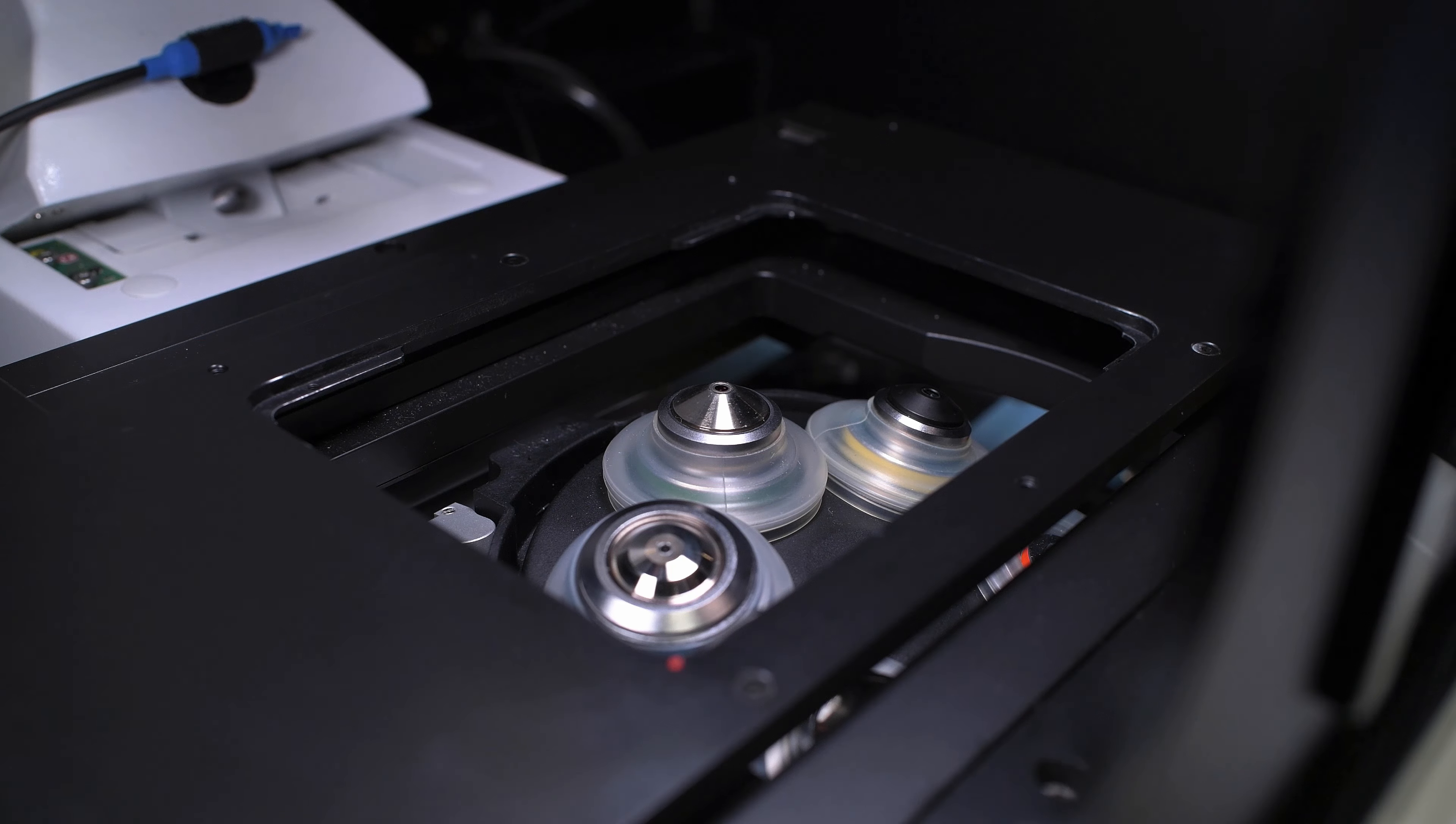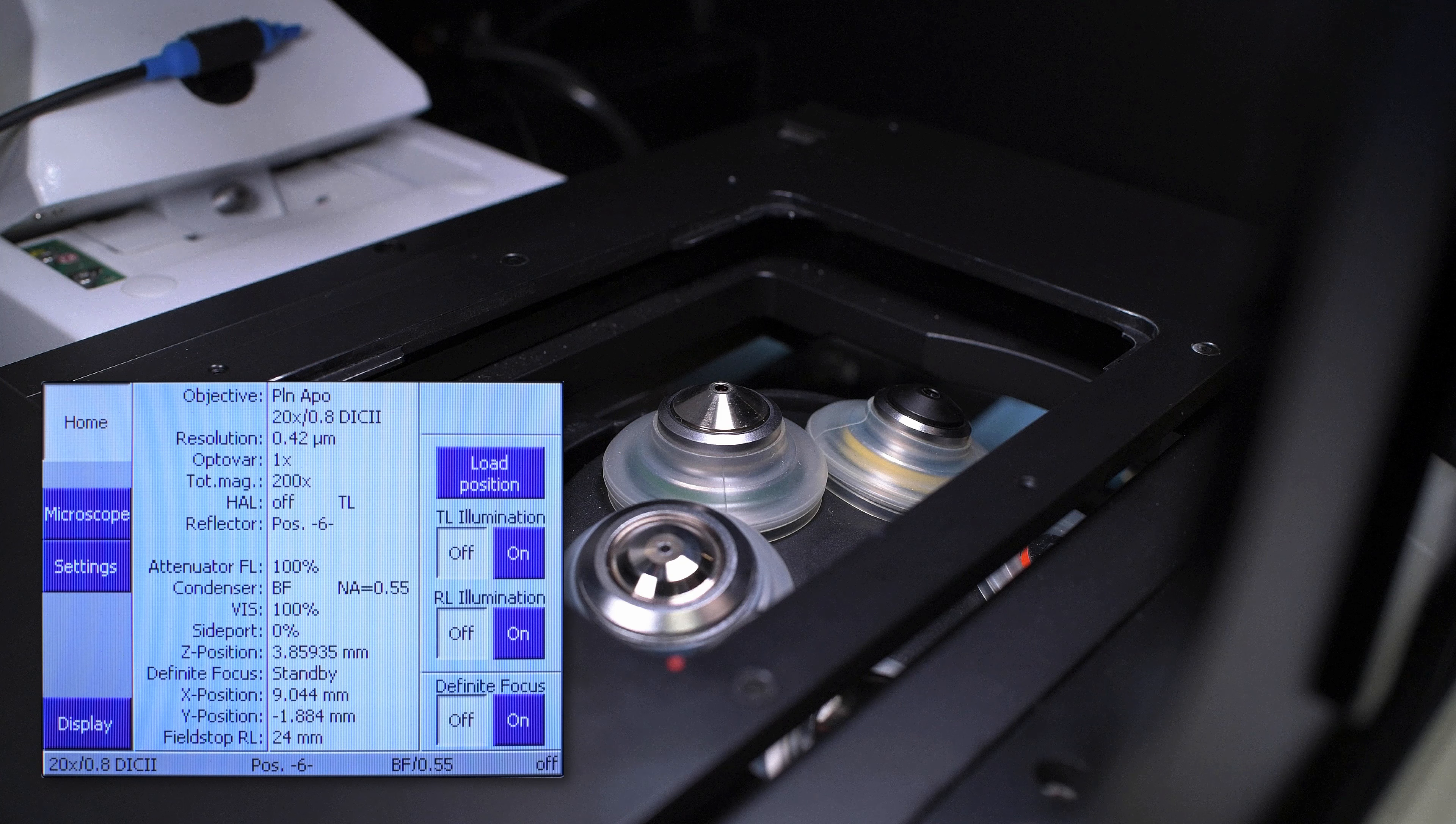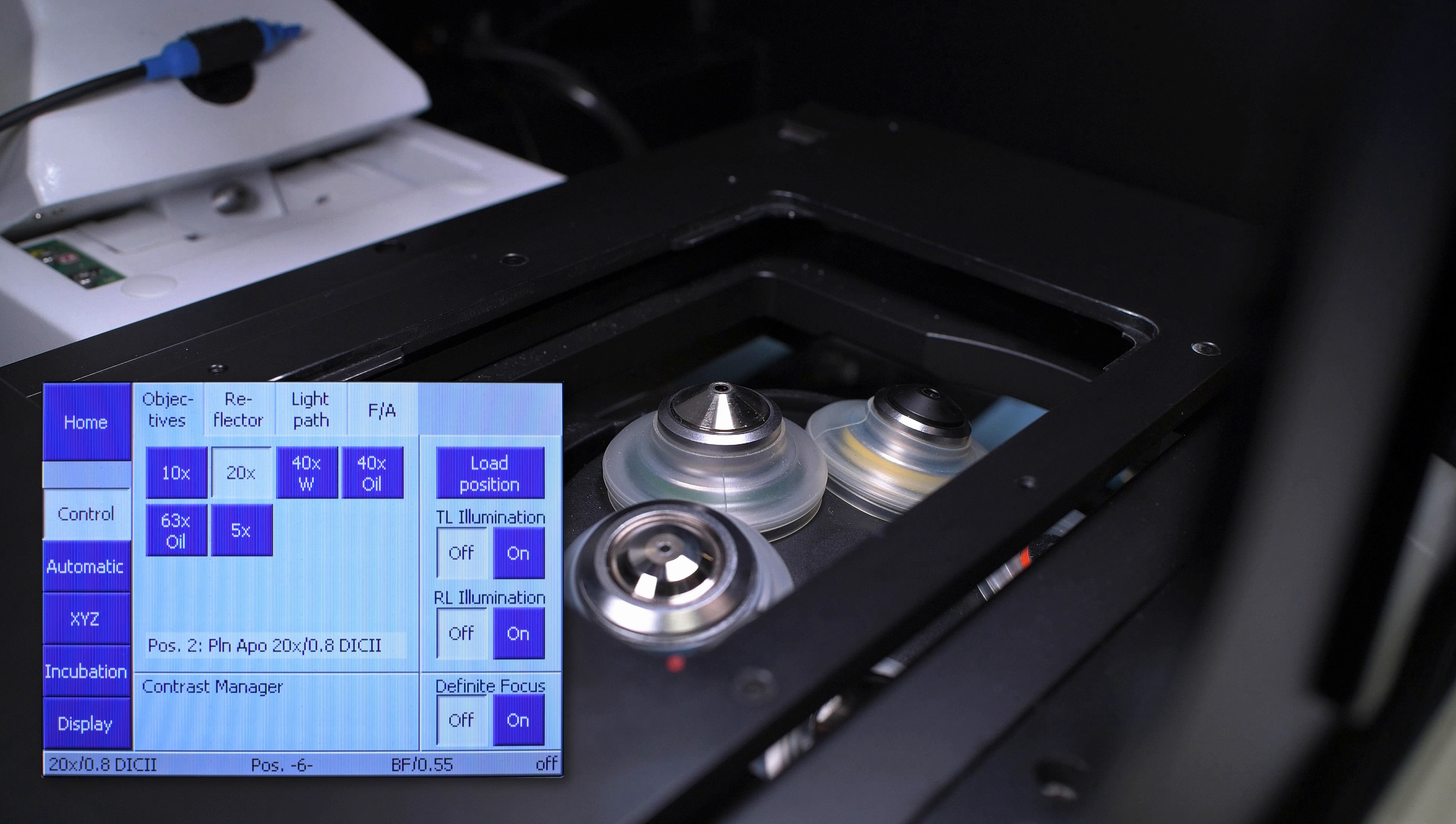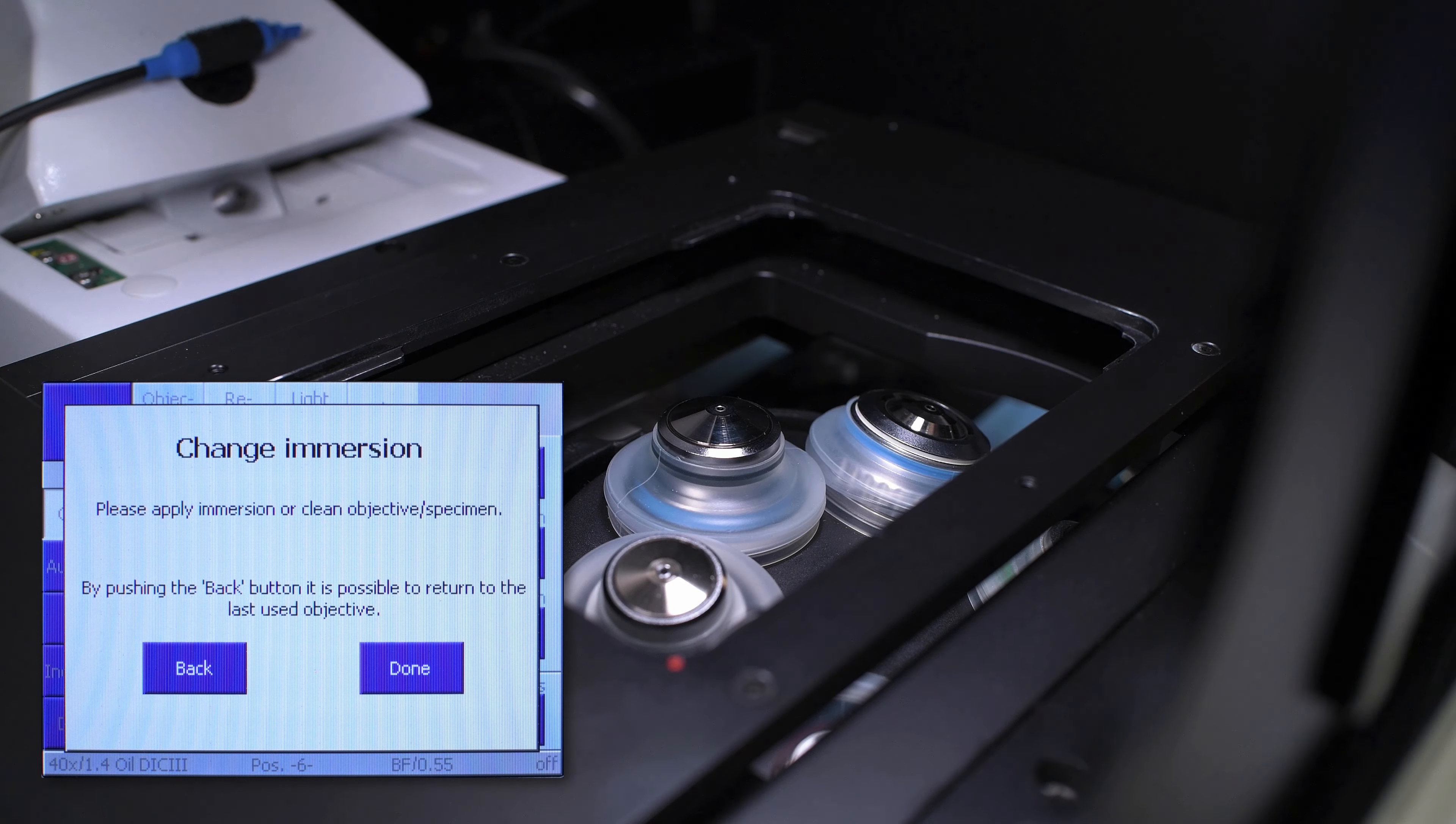Ensure that there is no sample holder mounted on the stage and that the area around the objectives is clear. To select the correct objective, locate the TFT display to the right of the microscope and make sure you are selected on the home screen. On the left hand side of the display, click on the microscope tab. From the control tab, select objectives from the top menu, then select 40x oil from the objective list. This action will move the objective focus down away from the specimen plane and then rotate the turret to the objective you chose.